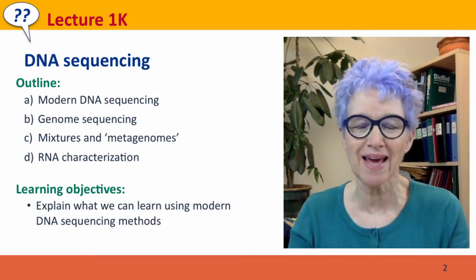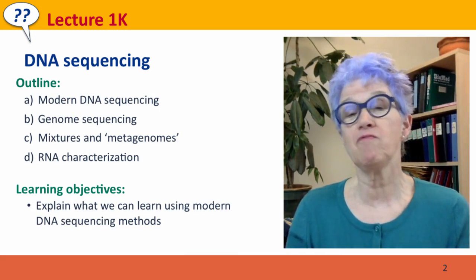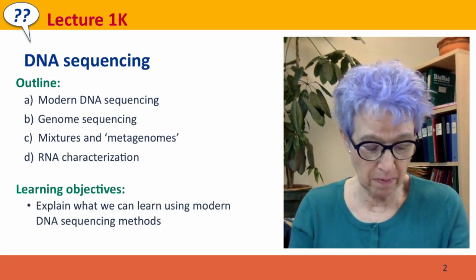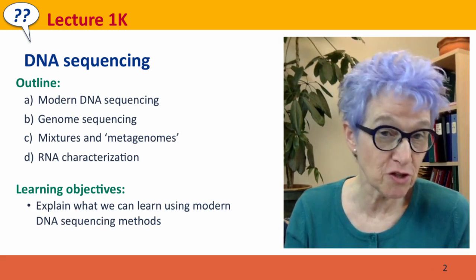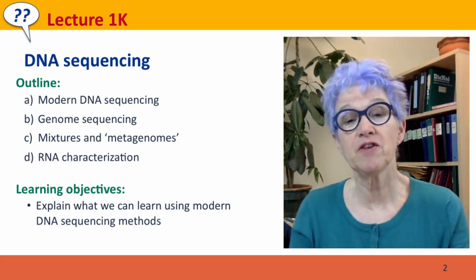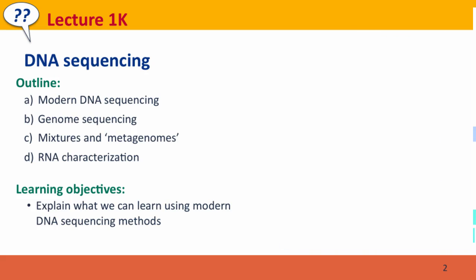This is Lecture 1K, which is going to be a very short overview of the marvels of modern DNA sequencing. So we'll talk about what the technology is, how it differs from what we used to be able to do, and the different things that we can learn using this technology.